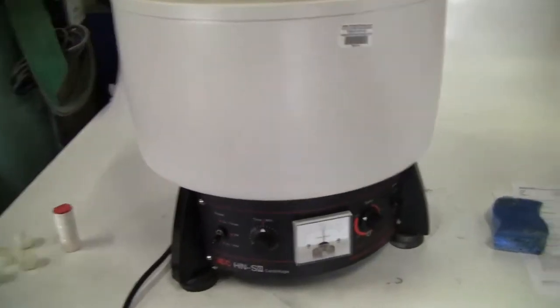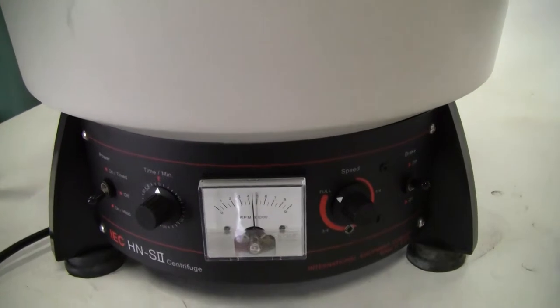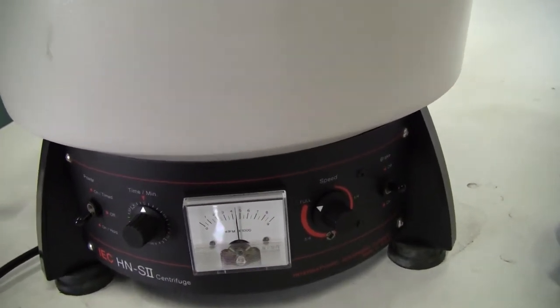This particular rotor, which is a six-place rotor, is maxing out at just about 4,500 RPM.